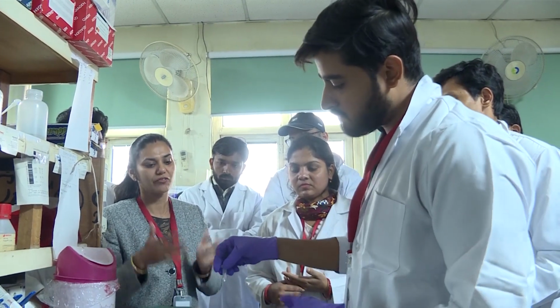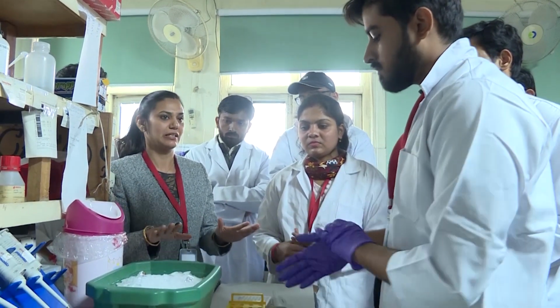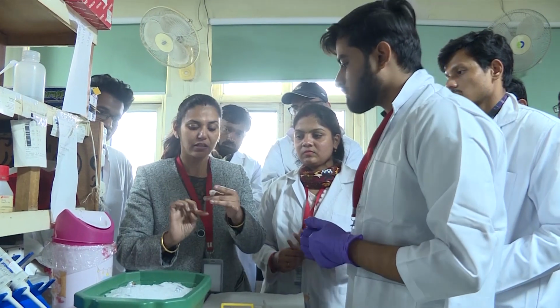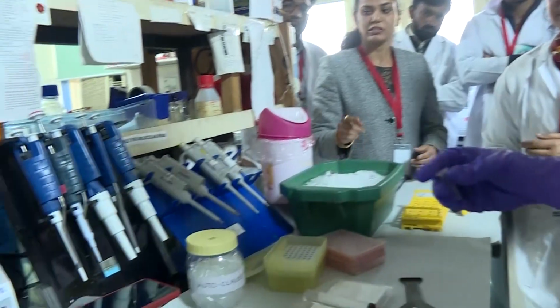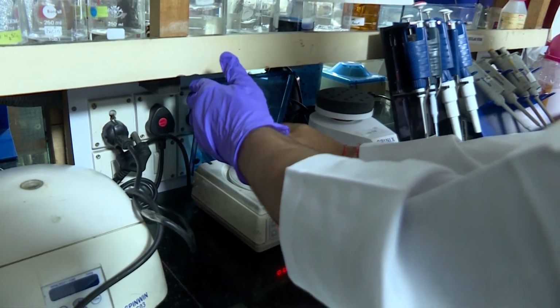Always wear gloves, and your place should not be contaminated with anything. Have you mixed it? For mixing, you can spin it so that your water and SYBR are mixed properly.